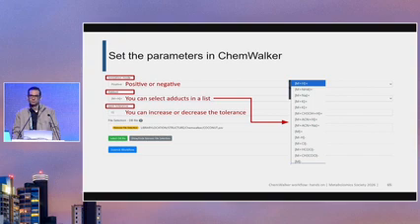Then, when you know the drugs you're really interested in, you can set an actual threshold for the abundance or the peak area or anything like that. Be strict on the abundance itself, or on the actual statistics for your visualization and interpretation, as the last step, not the first one.